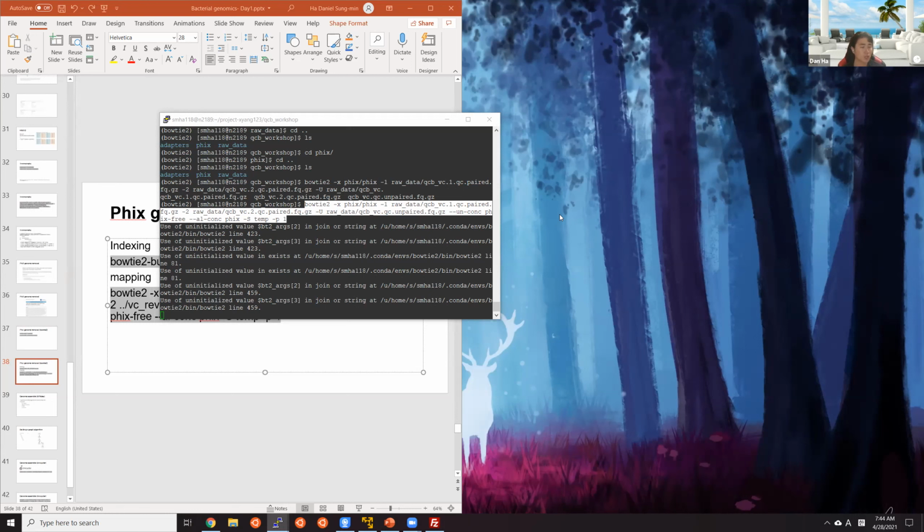Are you asking what comes after PhiX removal, Maura? Then we're gonna assemble the genome. We're gonna use those PhiX free raw data and put them into an assembler.